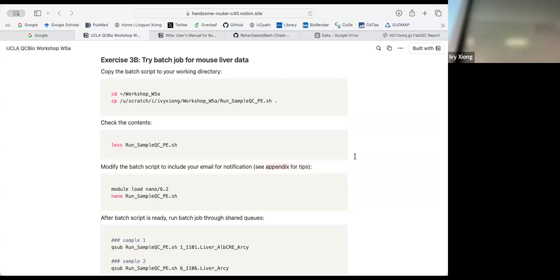Make sure that it's right, it's the email, and then try. Yeah, I think it's good. And then you can go through the pipeline. Okay, and now I can go to the next step. Yeah, I was just stuck there. Okay, let's do that.